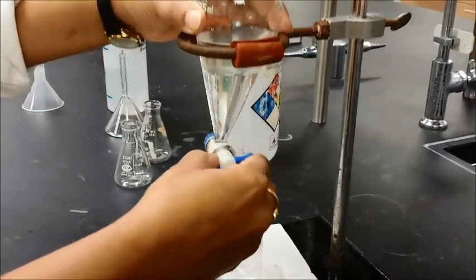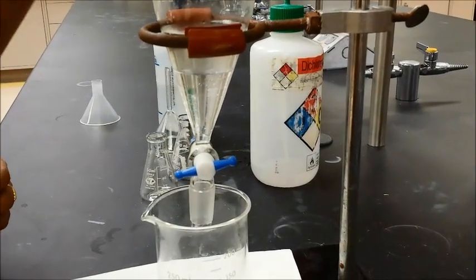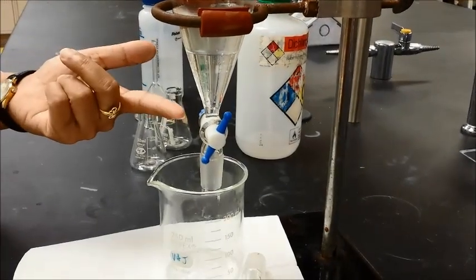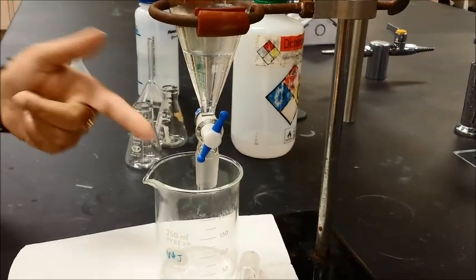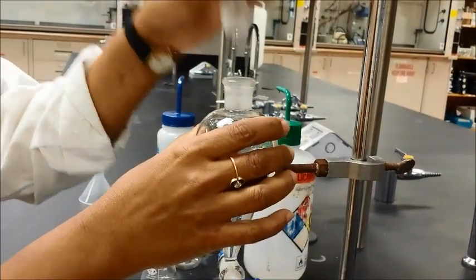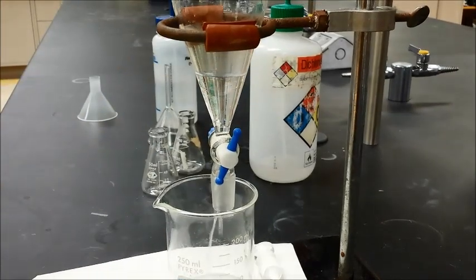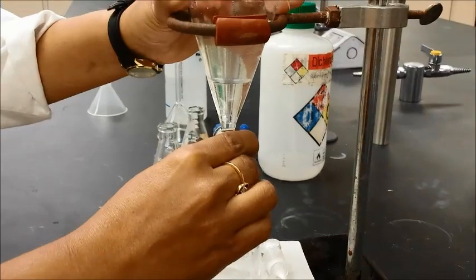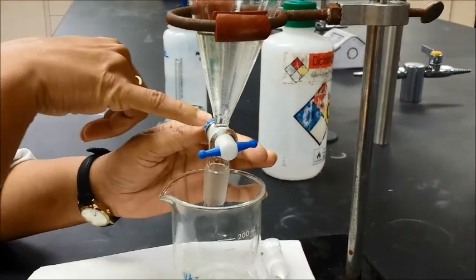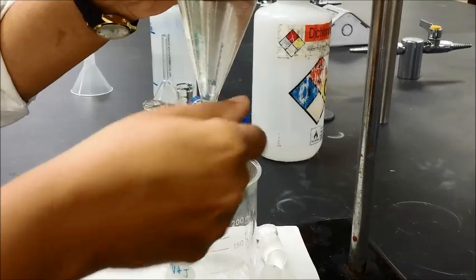Then you can go ahead and release the lower layer. The lower layer is our organic layer because dichloromethane is heavier. One thing that happens is if you forget to remove the stopper and start draining the lower layer, at one point it's going to stop because there is no more air to release — a vacuum builds up and suddenly nothing comes out. At that point, close the stopcock and remove the stopper, because that is what is preventing the liquid from coming down. If you're collecting the lower layer, you can leave a little bit in the separatory funnel — stop right at the hole, especially if there is emulsion.